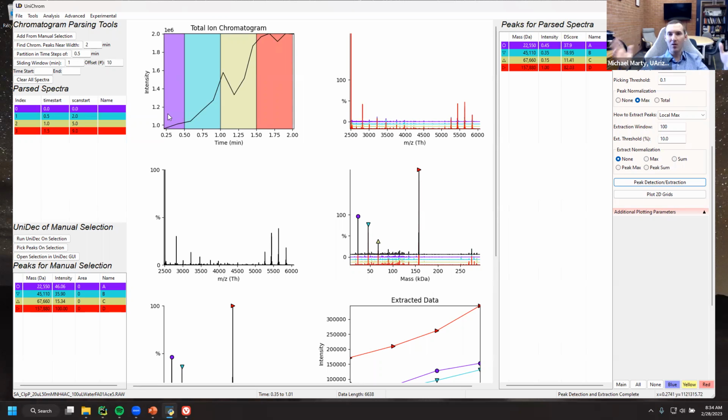If you did a 2-hour run but averaged it over every minute, totally fine. 120 scans would be no problem. If you did a 2-hour run and had 1-second scans, it may struggle. But honestly, we've done over 1,000 scans before, and it will work. It's just going to take time for it to deconvolve 1,000 scans. You can optimize that in different ways.